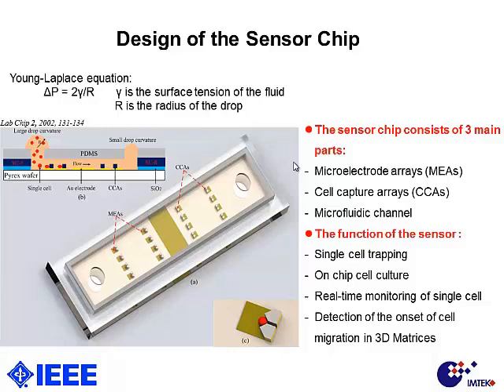This method is very helpful with cell-based sensors, especially in the microfluidic channel, because you only need to use the pipette once to fill the channel with medium, and after that you just put a drop on one side, and we can induce the flow inside the channel.